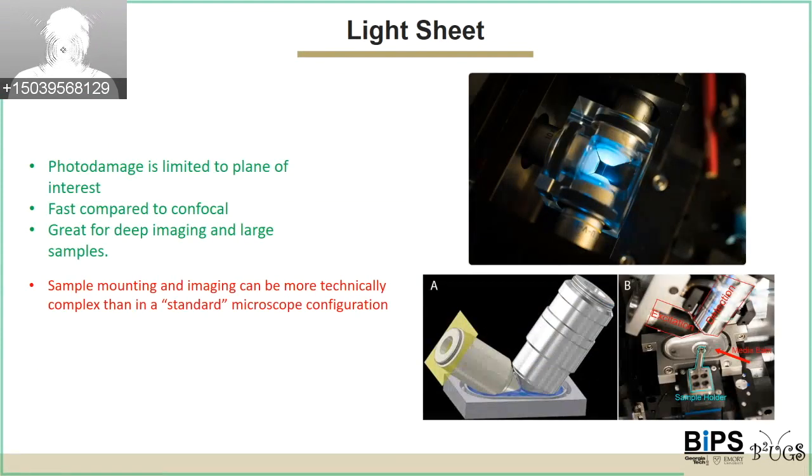Why doesn't everyone use it? The answer is partially because light sheet is generally a little less user-friendly than confocal microscopy. For example, in many systems, the sample needs to be embedded in agarose, then dipped into the microscope from above, then rotated or translated to see different planes. There are so-called inverted light sheet systems, and that can accommodate a more traditional sample mounting. And overall applications are definitely increasing for light sheets. So you can expect to see this technique becoming more and more common.